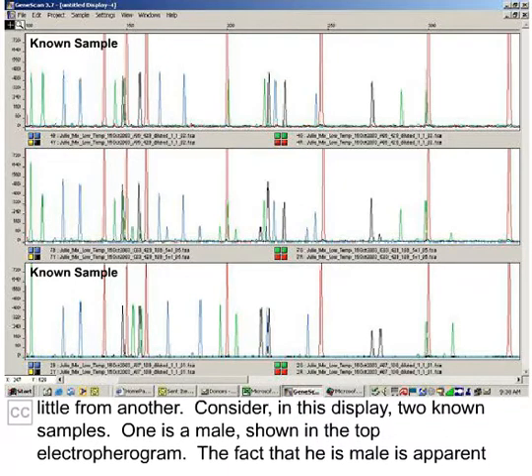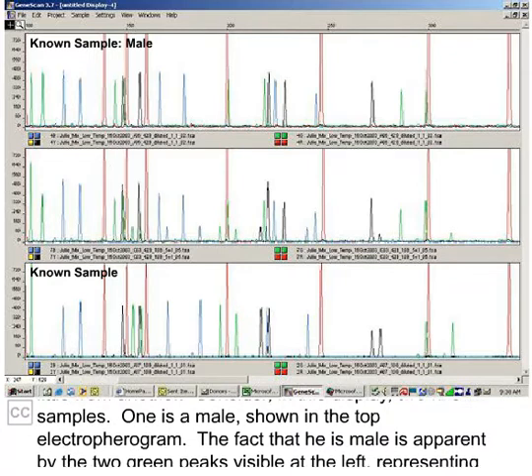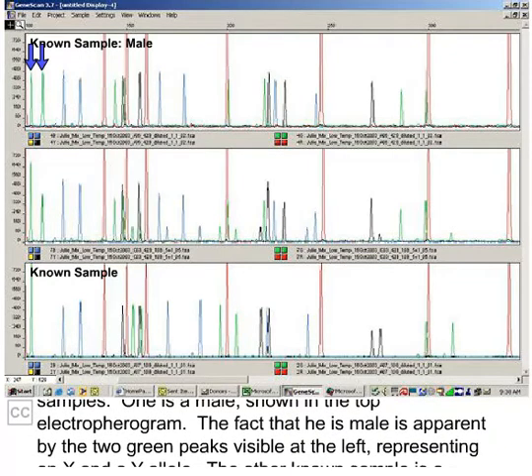One is a male, shown in the top electropherogram. The fact that he is male is apparent by the two green peaks visible at the left, representing an X and a Y allele.